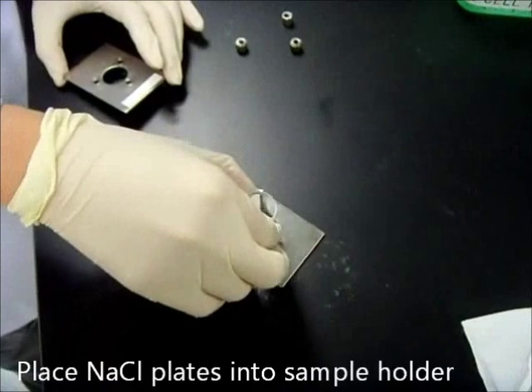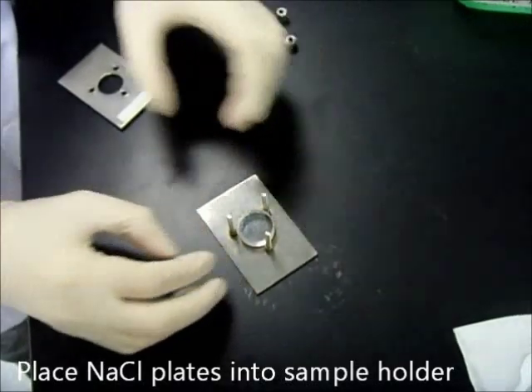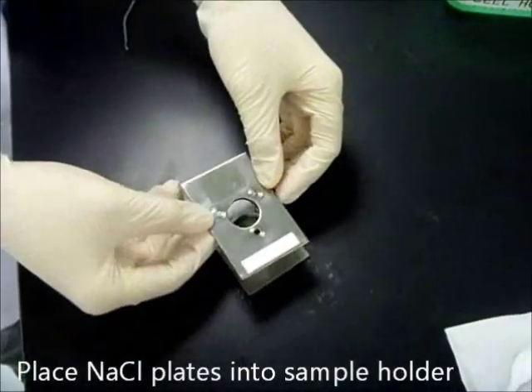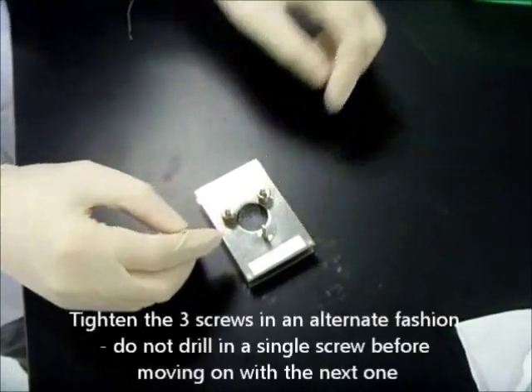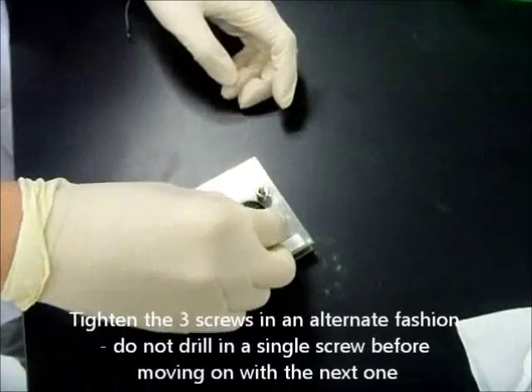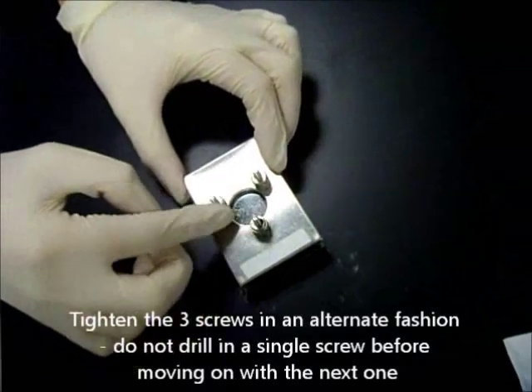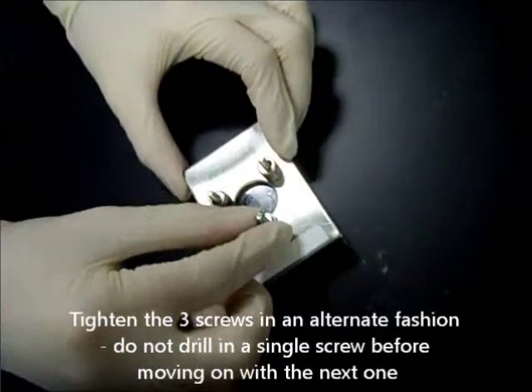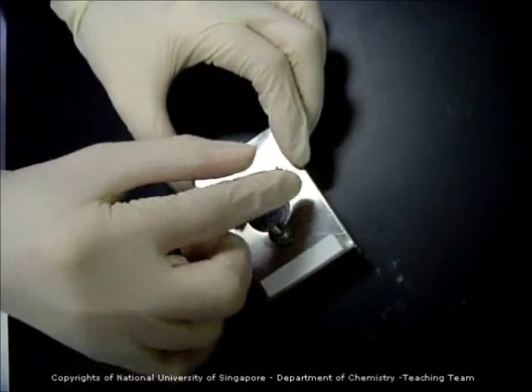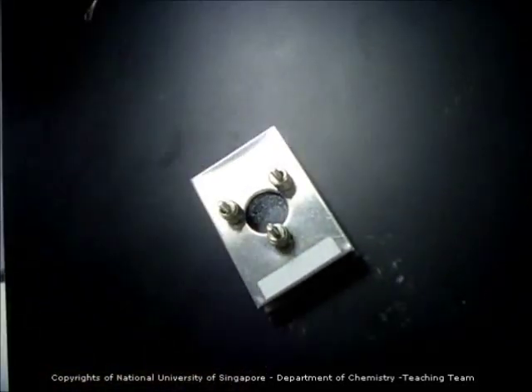Sodium chloride plates sample holder Type 1: place the sodium chloride plates into the basement of the sample holder, and then put the cap on. Tighten the three screws in an alternate fashion — put each screw in two to three rounds, then move on to the next screw, two to three rounds again, and slowly adjust. Because if you screw one too tightly first, it will crack the plate.